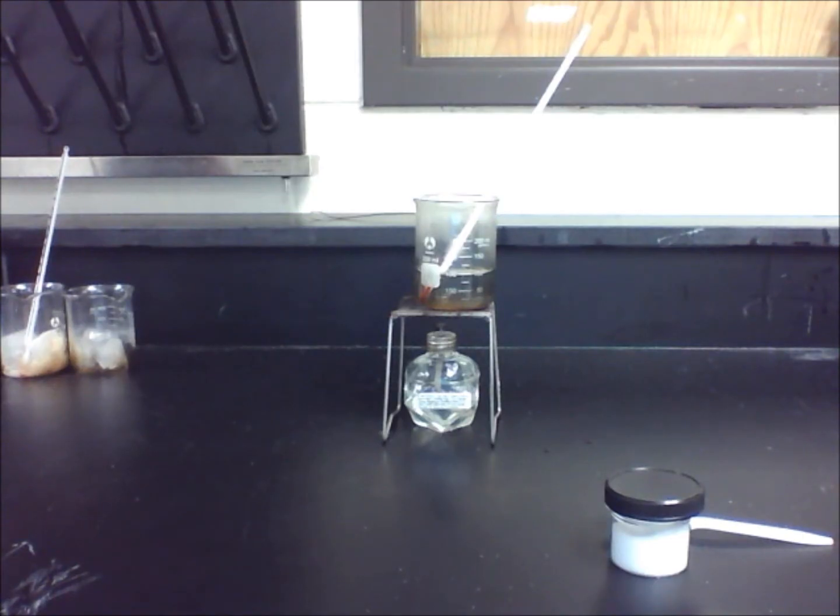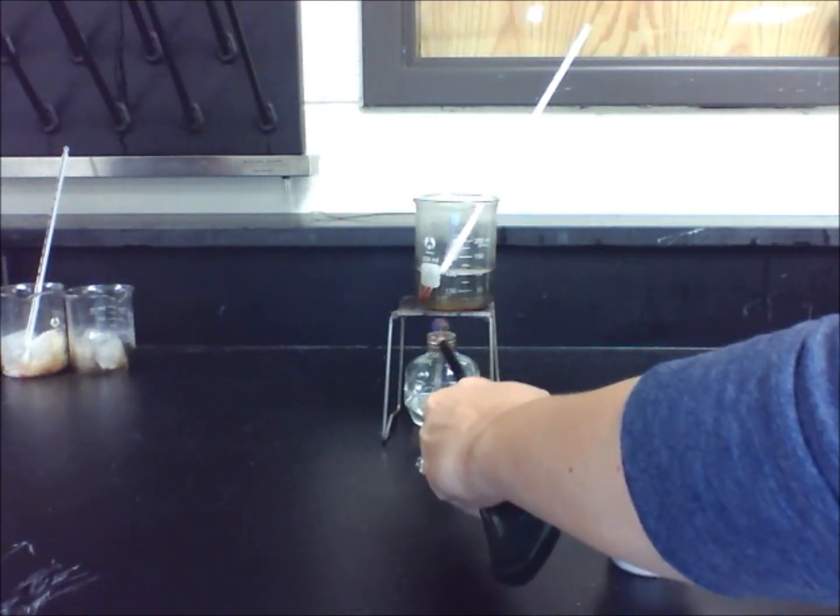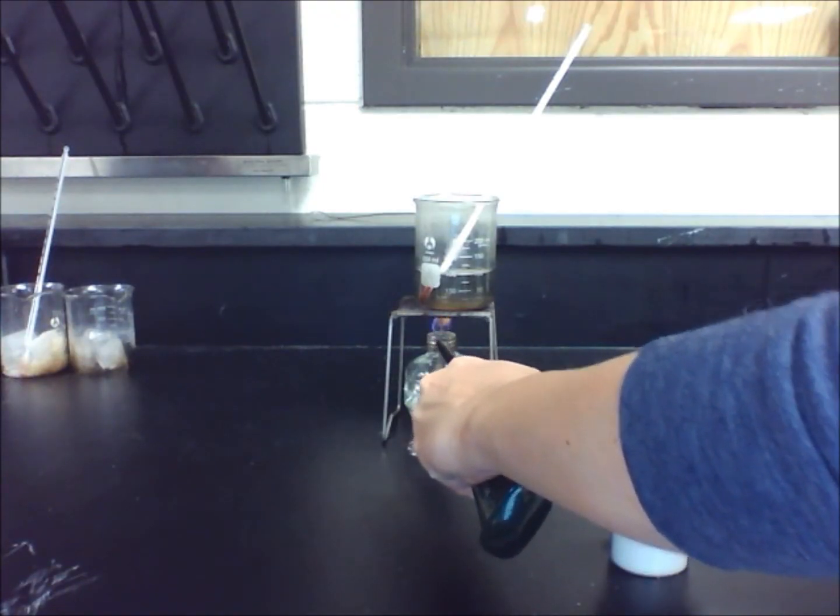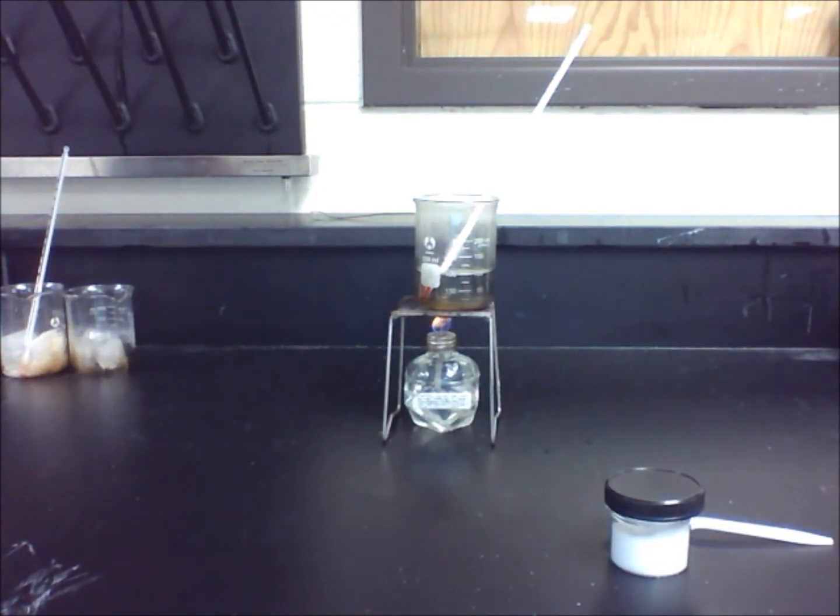First, add 100 milliliters of hot water into a beaker. Place a thermometer in the beaker, and then place the beaker on a burner stand and heat the water until it boils.